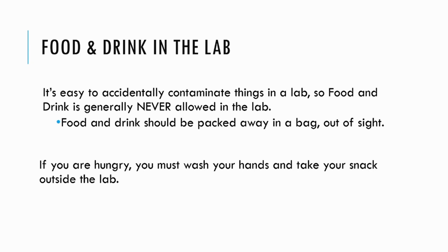Sometimes labs do go long though, and you need a snack or a break, and that's okay. Make sure to talk with your instructor about what's allowed or not when it comes to breaks. But in general, if you're hungry or thirsty and you really do need that break, just make sure that you wash up, make sure that your lab bench is safe and clean, wash your hands, take your snack outside of the lab, enjoy, and then come back in. Don't consume any sort of food or drink without washing your hands, and don't consume it inside the lab itself.